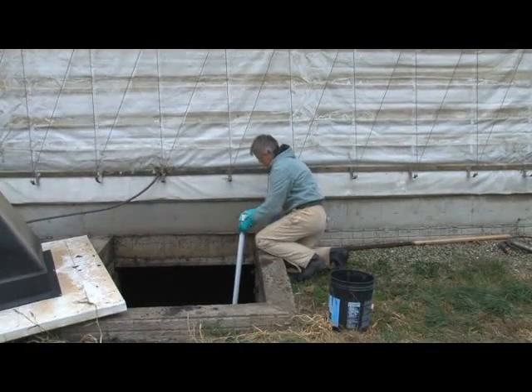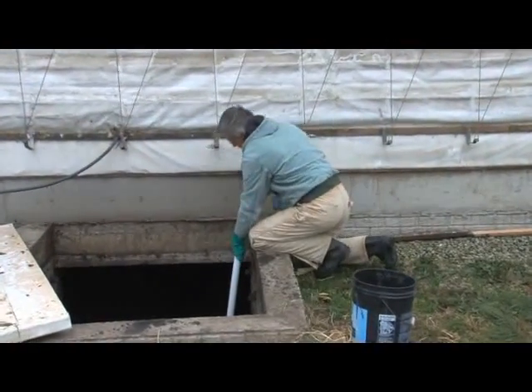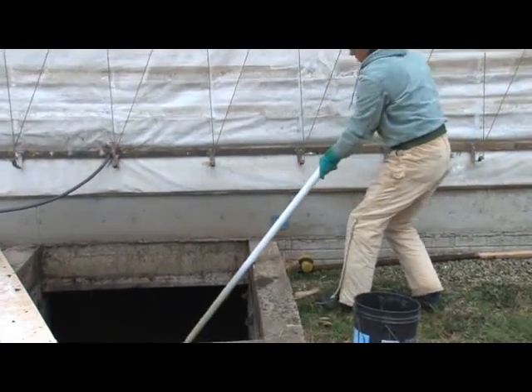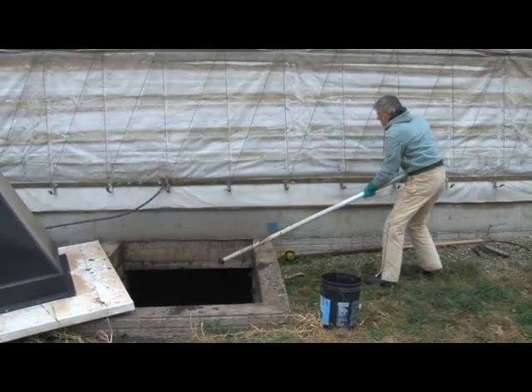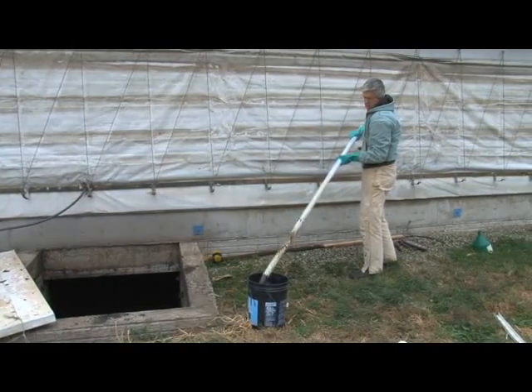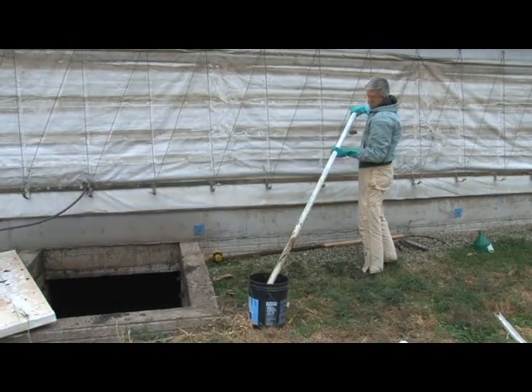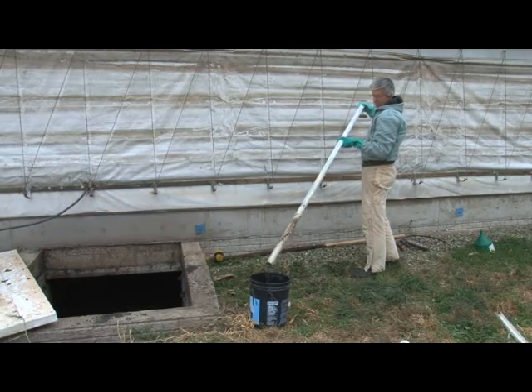To take a sample, release the plug and run the pipe down into the manure all the way to the bottom, then pull the plug tight. You should only sample from the solids at the bottom of the storage structure if in fact those solids will be completely agitated and removed from the structure. Take the sampler over to the sample bucket and release the plug, emptying the sample into the bucket.